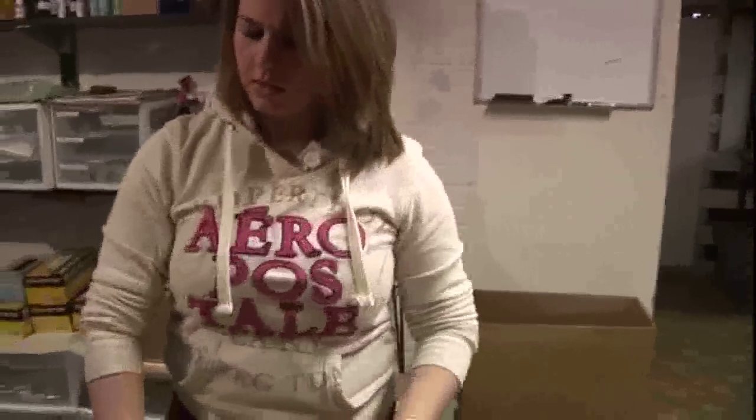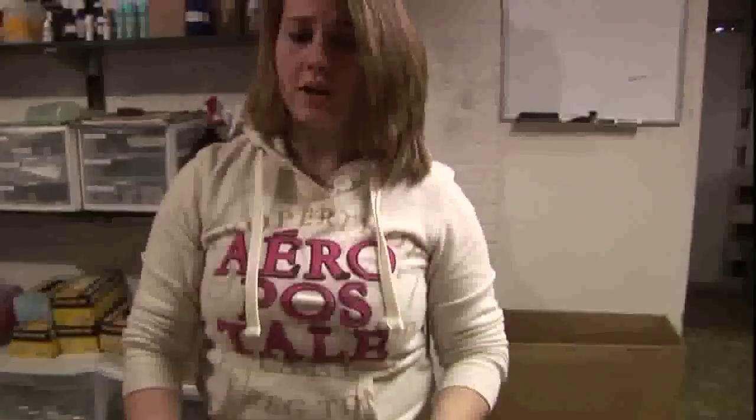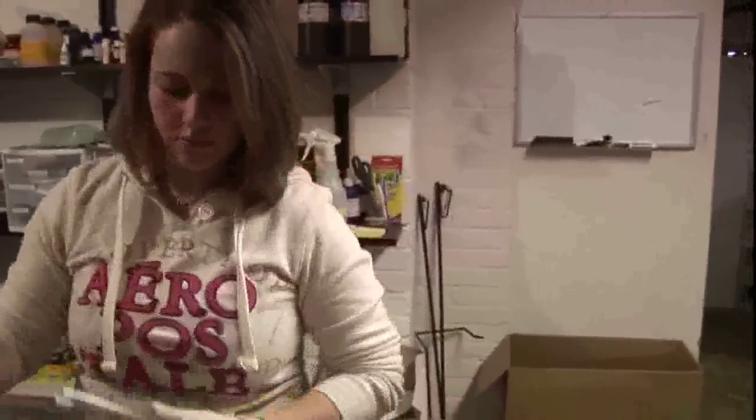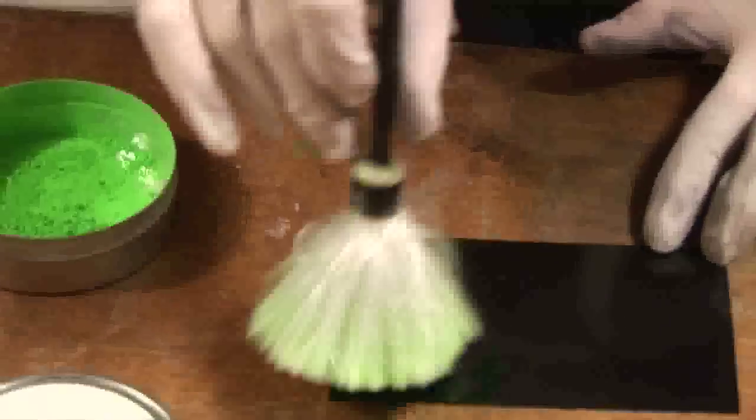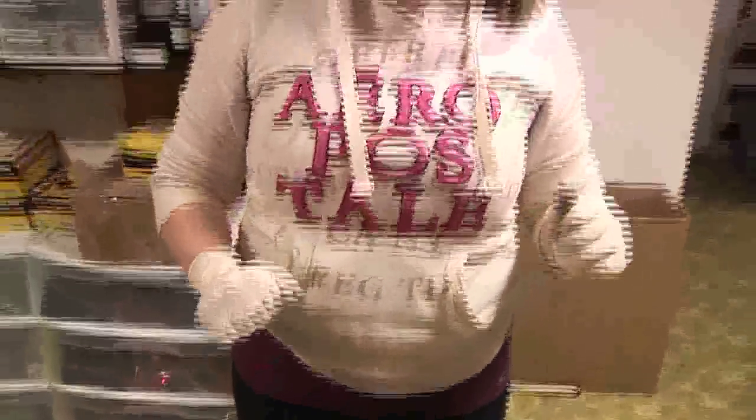Now we'll move on to fluorescent powder. There are a lot of different kinds of fluorescent powder — I'm going to demonstrate with green, but there's also orange, pink, and red. We'll go check out the ALS. I have a demo that I did on the cover of a magazine so we can see what that looks like with fluorescent light.